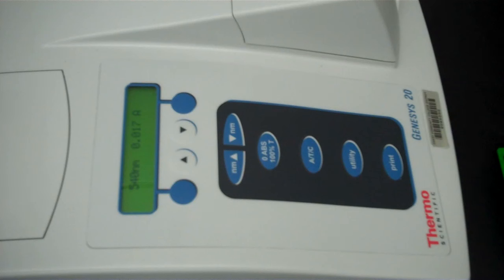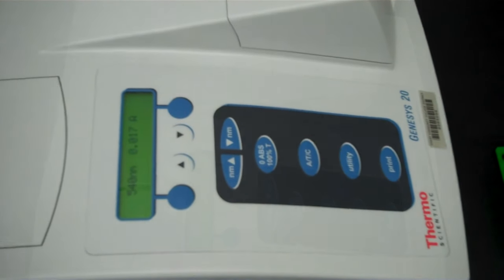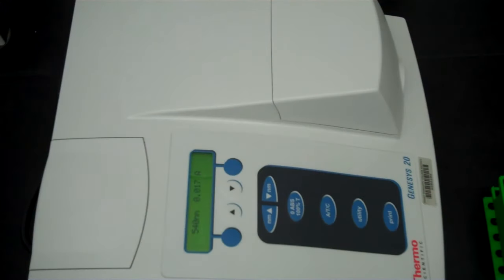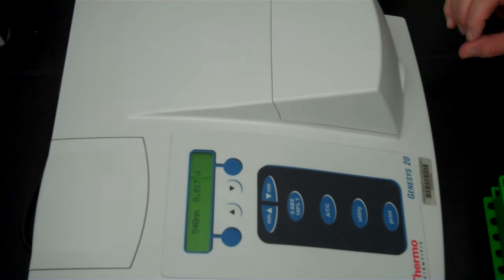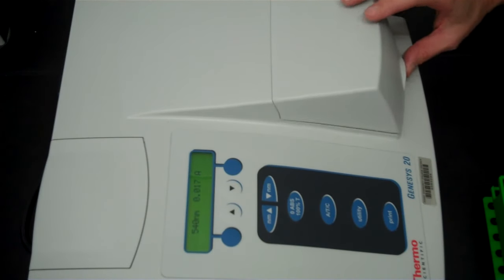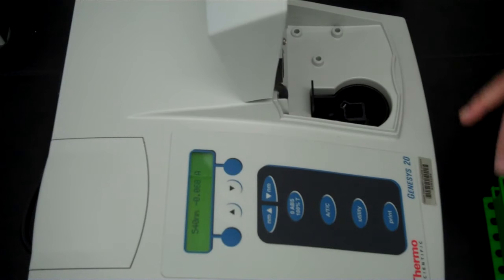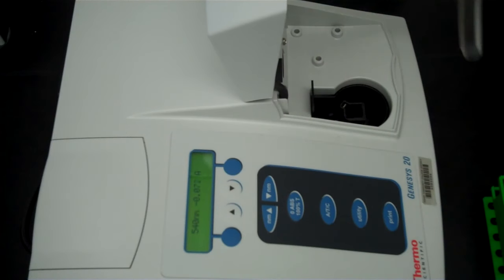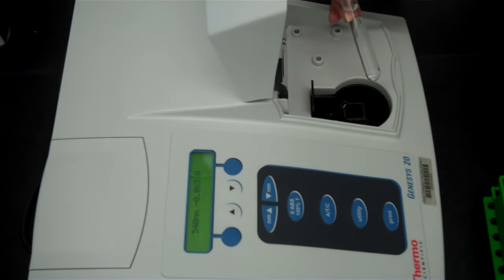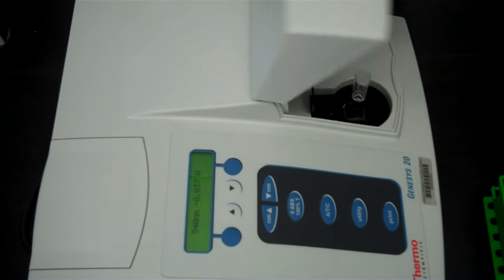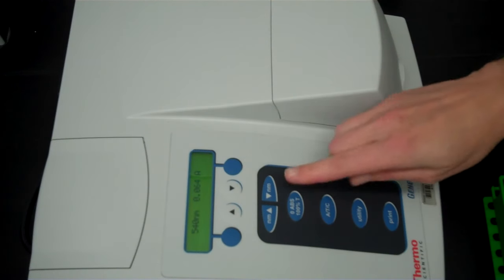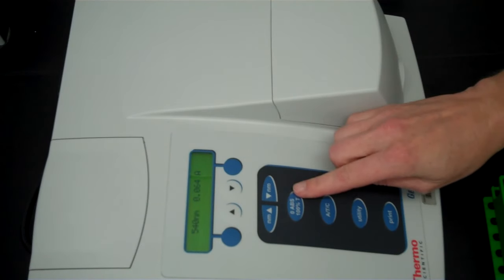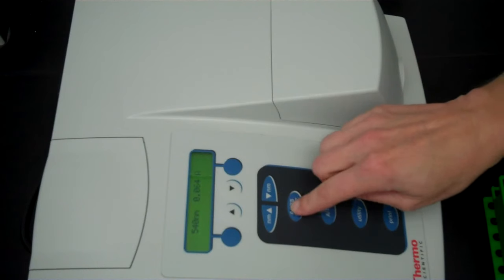Now that it is set to 540 nanometers for this example demonstration, I'm going to blank the machine. This will require a solvent blank. All you do is you open the chamber, you put in your solvent blank which is in a prepared cuvet, close the chamber, and press the button that says 0 ABS 100% T.